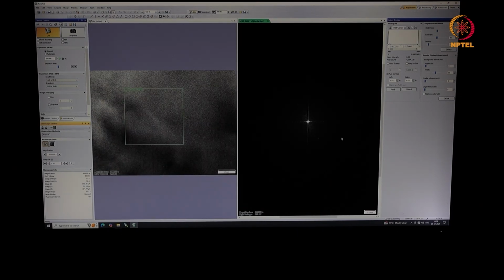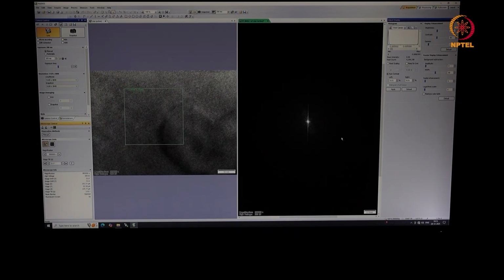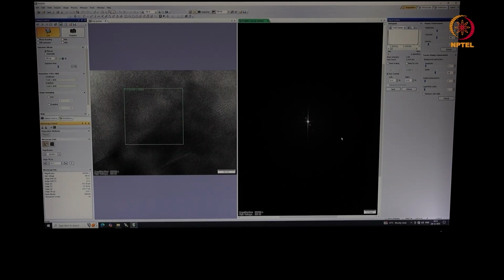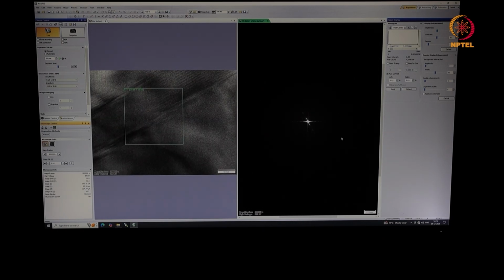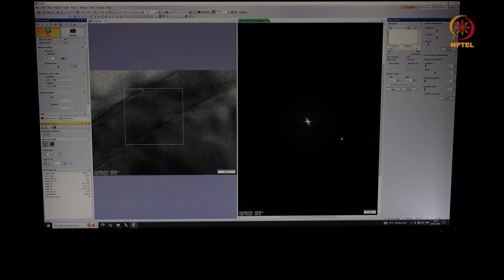Should get them. One of the roughing pumps is now running in the background, so we'll have an issue in getting the best resolution, but I'll go slightly under focus and have to change the exposure time now.